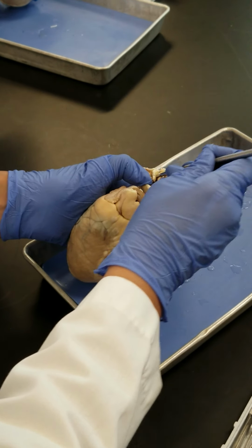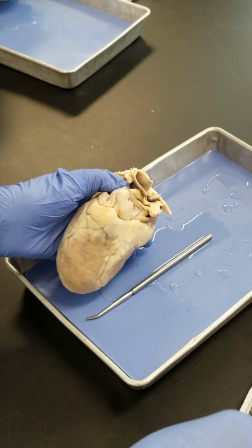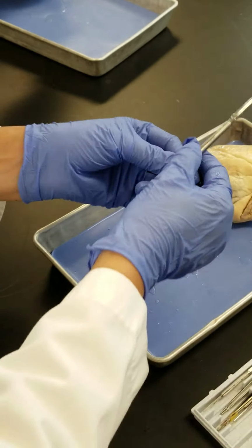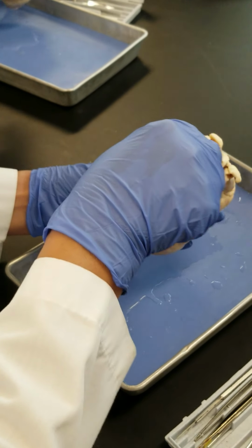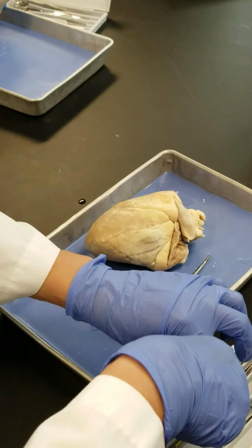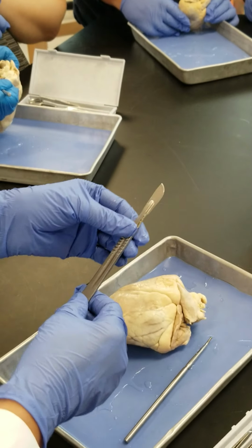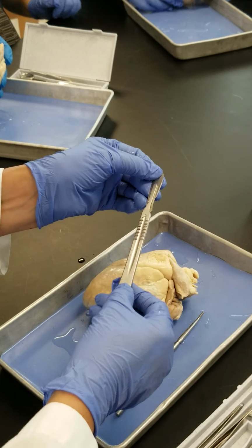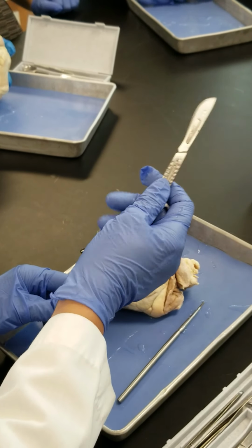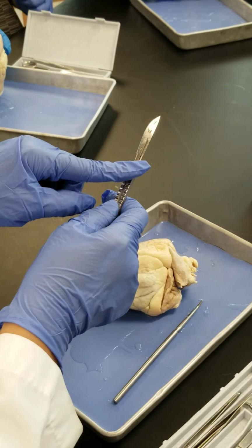When you go and look into that, you can separate it a little bit. Oh, I forgot about these dissection tools to explain to us. This is a probe that you use mostly for pointing, finding, and going through the holes. And you have the scalpel. This is a scalpel that has a blade and a handle here. But just make sure you are working with the scalpel. These blades are very sharp, or can be very sharp, right?